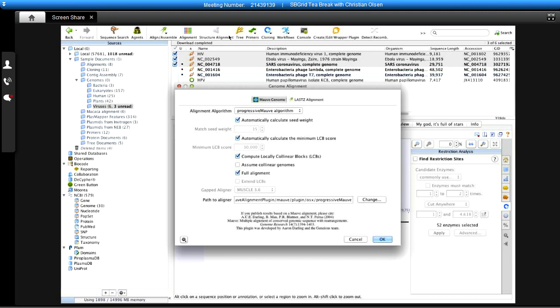You can see we've got the reference for where the algorithm was first published. So you can go straight to the publication and you can see all of the different parameters or the different ways that this algorithm was used.